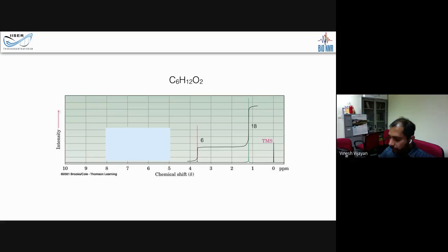Okay. Now, what will be the structure of this molecule? This is also very similar, but you have 2 oxygens now. Okay, you have 2 oxygens, so you have to worry about that, and also the chemical shift. This is quite deshielded, while this is shielded. So this is probably attached to oxygen. This is not attached to an oxygen. You see this CH3 starts in C double bond O CH3. Okay, so this is the only way you can get to this one.